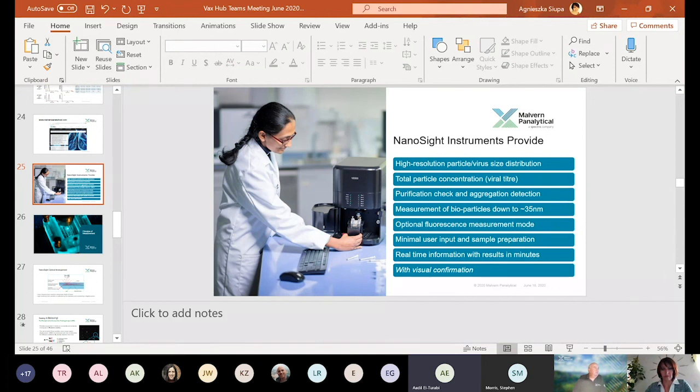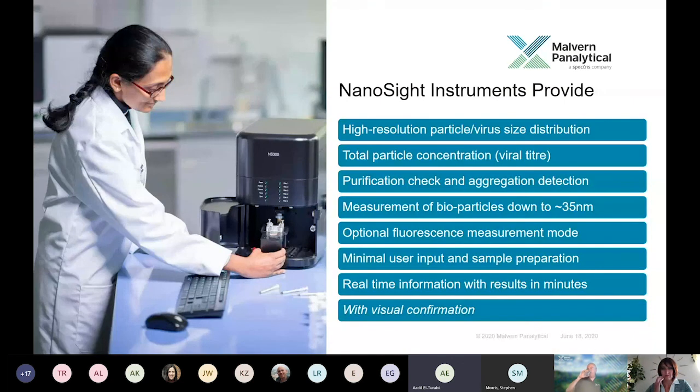Just a very quick one. I've used DLS in the past, and with the old Nanosizer, if you've got heterogeneity in your sample, it gives you this broad average which kind of spreads. I'm just wondering, based on what you've said, would you say that the Ultra could give better resolution? Yes, certainly we've seen that.